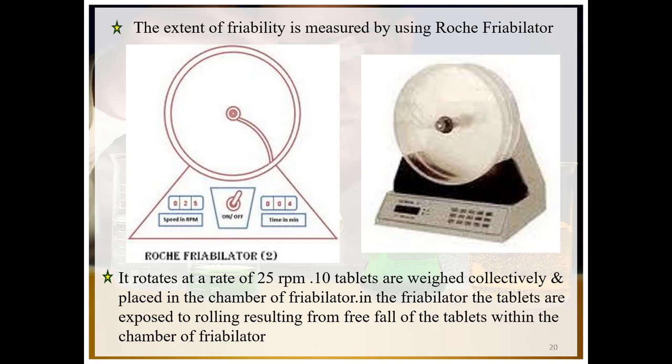As we know, according to the formula, the limit of the friability test shall not be more than 1%. I mean that the maximum loss of weight from a single test or from the mean of three tests is not greater than 1%, and is acceptable for most tablets.